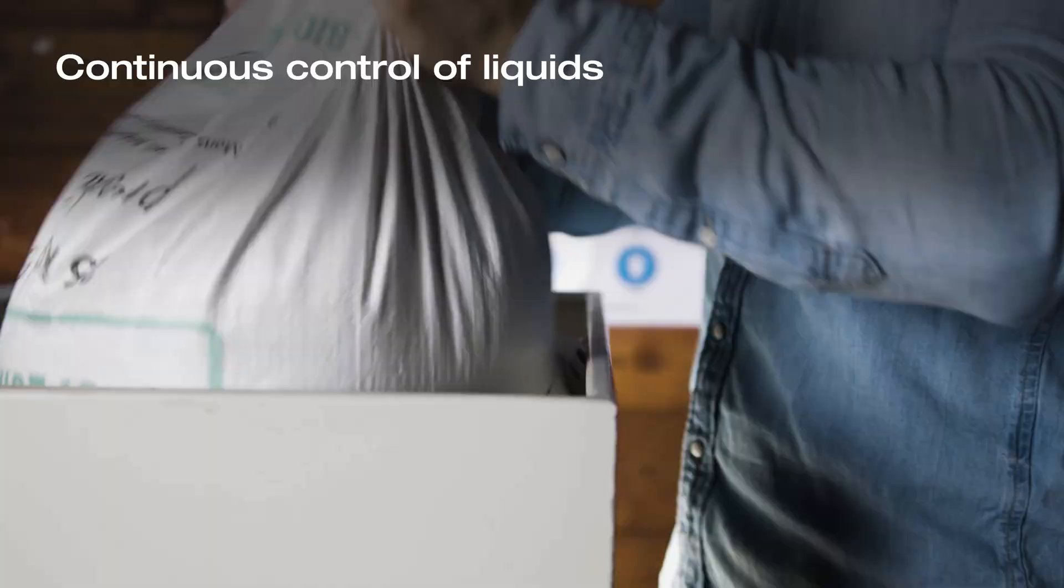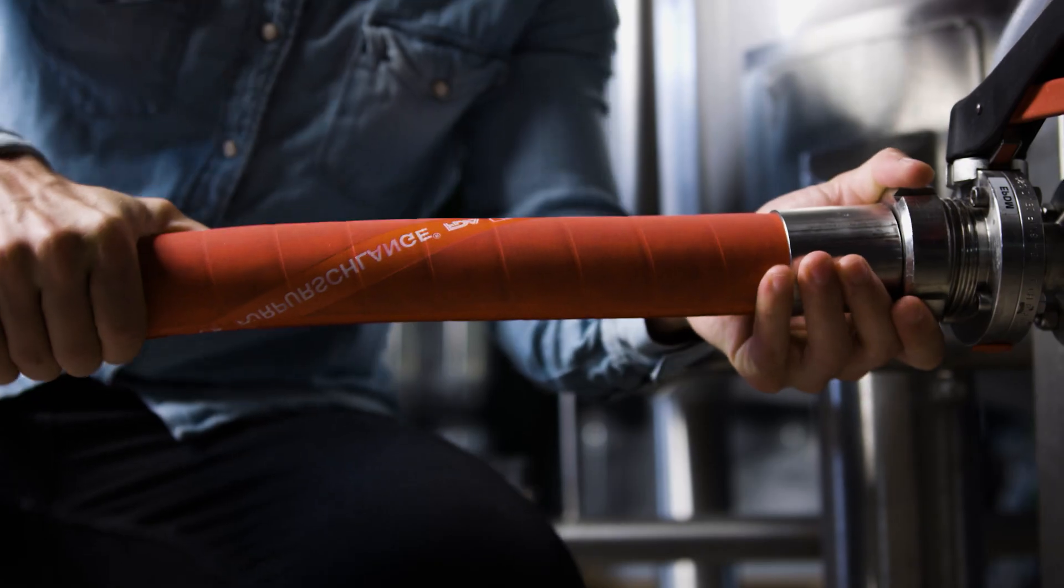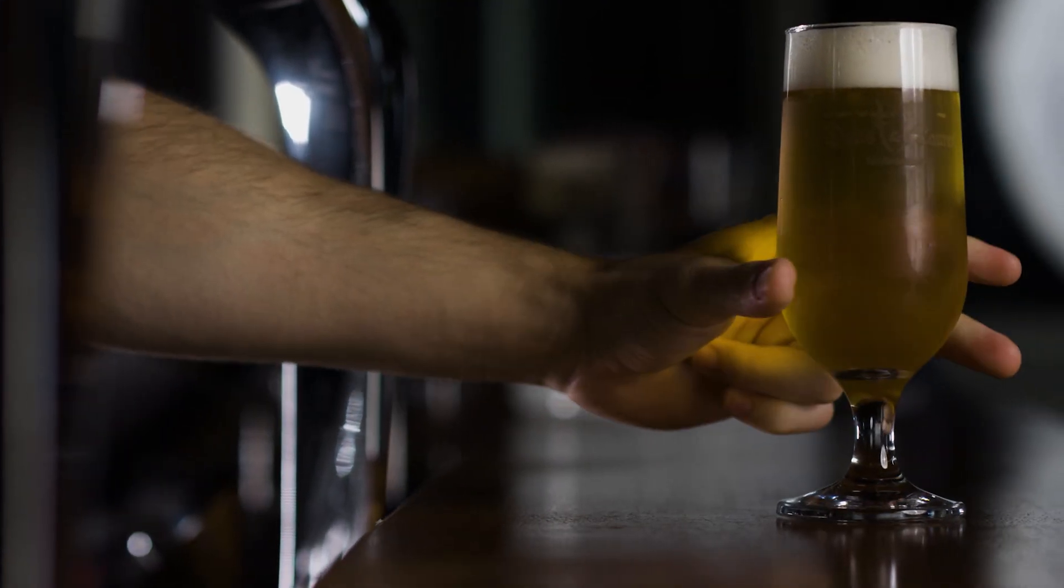From the brewery to the fermentation cellar, the flow rate, temperature, and concentration of your beer needs to be measured continuously throughout the entire brewing process to guarantee consistent taste and alcohol content in every batch.